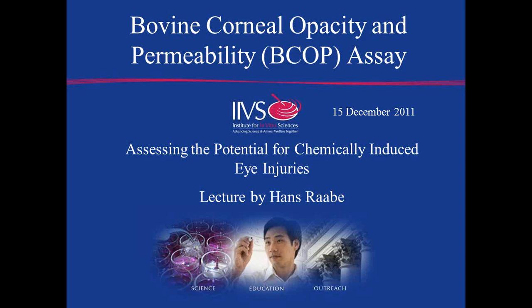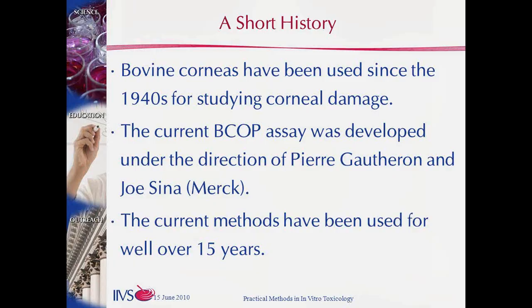Okay, so as Mandy had mentioned, I'd like to go through a brief history of how the assay came about, and then go through a fairly stepwise approach to how to conduct the assay. Our focus will be to identify the various steps that are identified in the OECD guidelines, but there are a number of cases where modifications and customizations to the assay can be conducted, and so we'll touch on those topics as well as we go through the presentation.